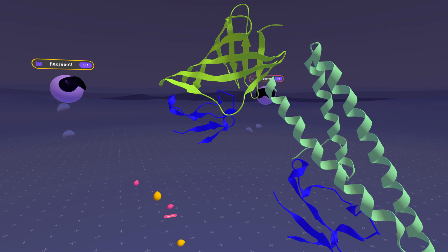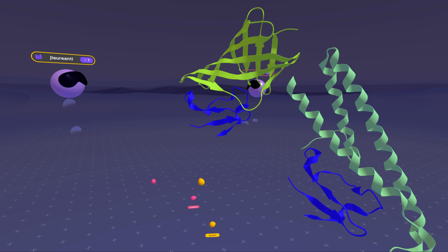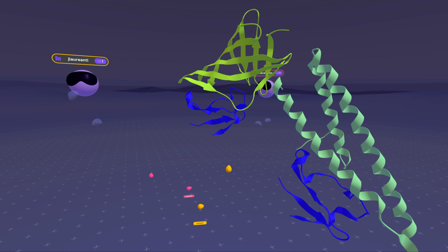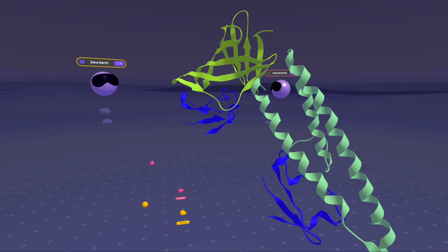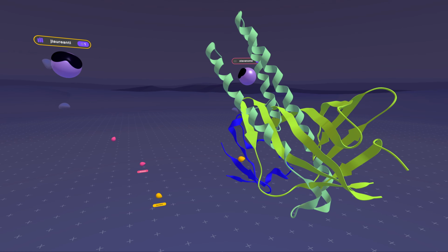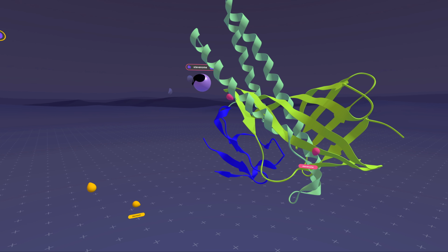Yeah, we can also use the structure actions tool to align proteins to this as well. So if we didn't want to just do a manual alignment, which is pretty nice and easy too, but if we wanted to let computations do it for us, we could just realign it here. And that really shows you just how different these two binders are, right?